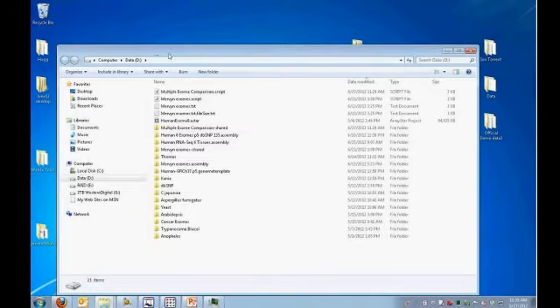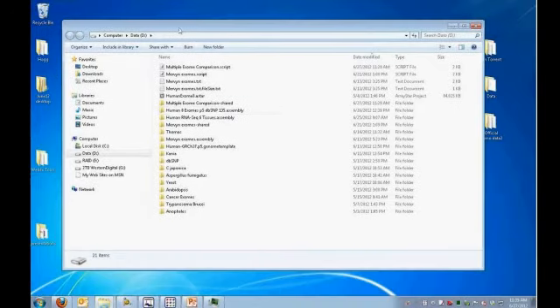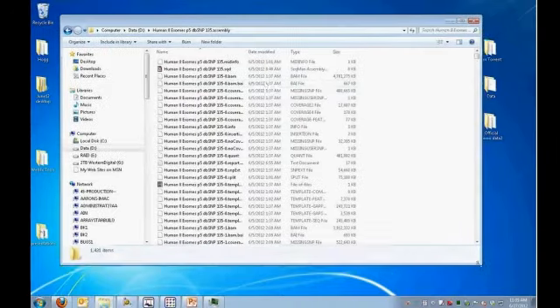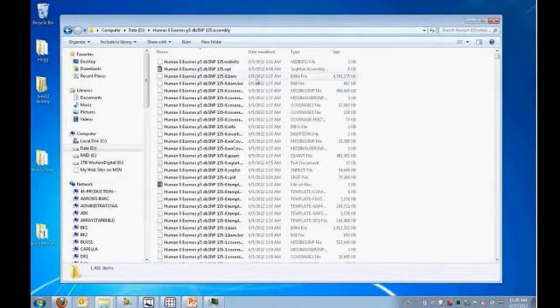Now the actual output file, actually I should minimize this just for a bit here, and I'm going to show you what the output looks like. And here's the output from the assembly that I had run, and it's 8 human exomes. You can see it's a big file. This is 65 gigabytes in size, and it's actually a folder that contains a lot of files in it. And you'll notice that these files are kind of repeated.